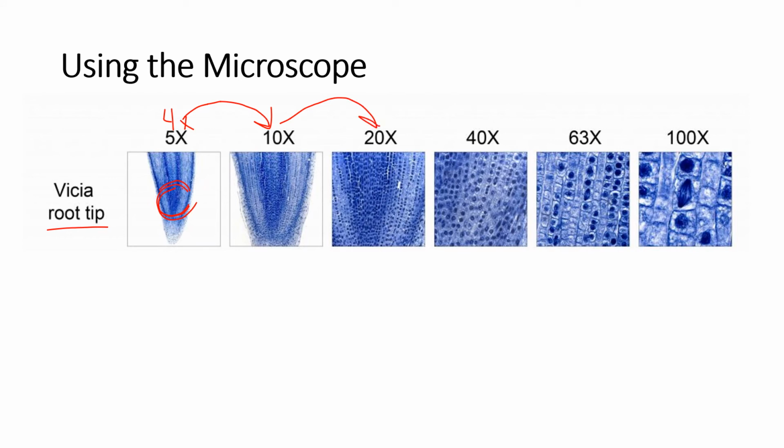This image has more lenses than what we use, but you switch to the next higher power, use the fine focus, next higher power, use the fine focus, and so on, till you get to the last objective using just the fine focus. And again, make sure whatever you're looking at is in the center, because if this area is in the center, then pretty soon this would be the area you're looking at and you wouldn't see any cells.